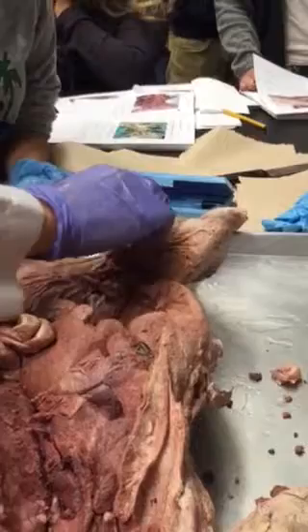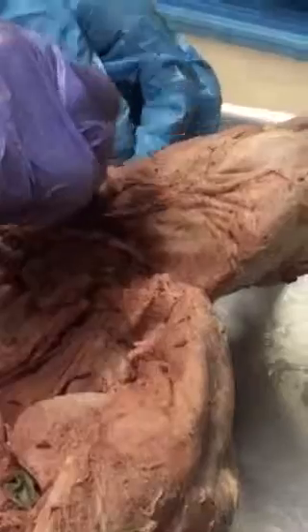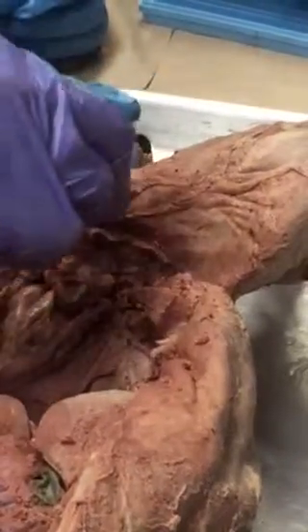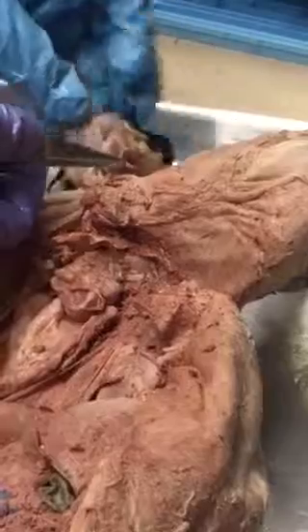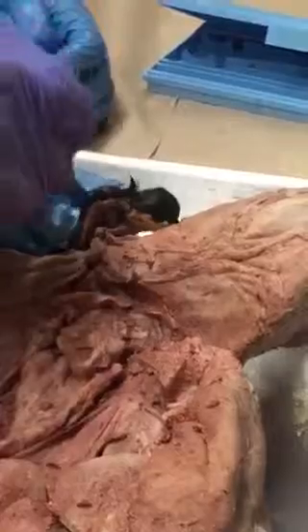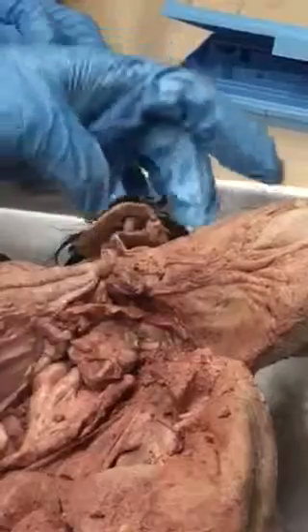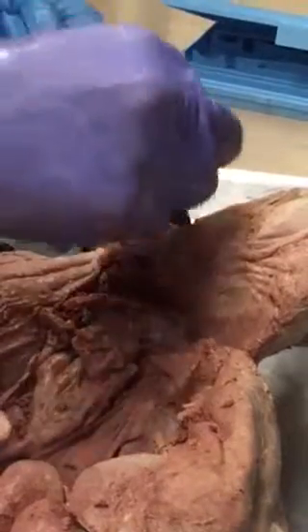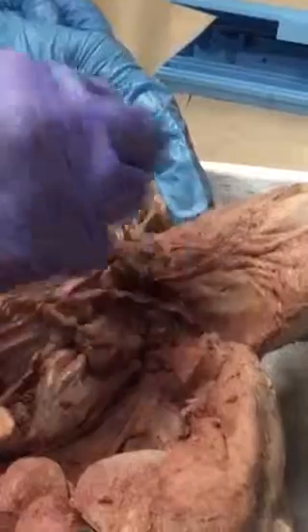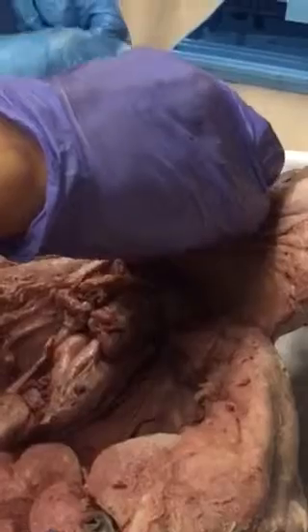Alright, so here's something you can see on here. So we have the vas deferens of the cat right here. These ducts that are carrying the sperm from the testes. I think we have at least one cat that does not have the fur on the testes. You can actually see the testes. And then we have the vas deferens, which is the tube coming from them. And then this should be the penis, if I could pull it out.